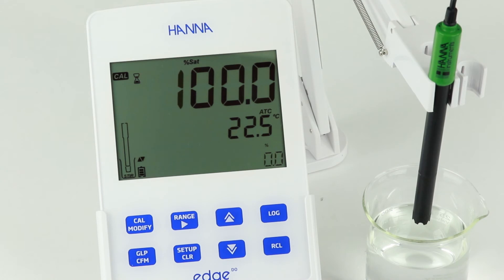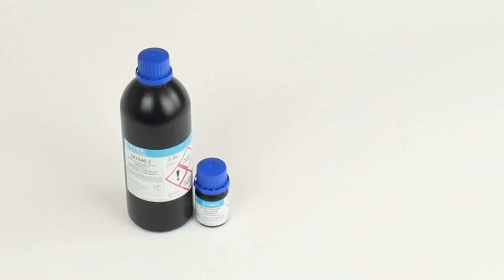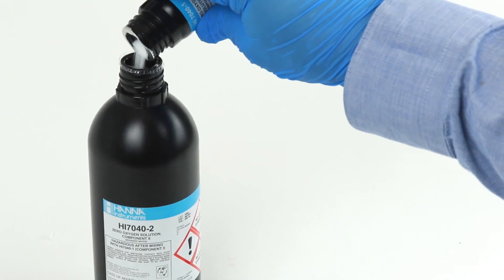If desired, press Cal to exit. Otherwise, we can proceed to the next calibration point. To calibrate at 0%, the zero oxygen solution must be prepared. To do this, simply mix the two supply components. The solution will be valid for one month.